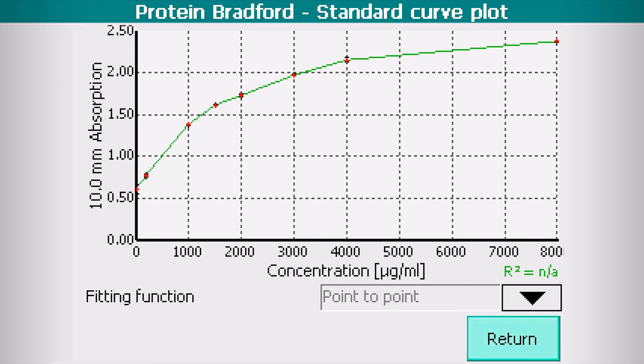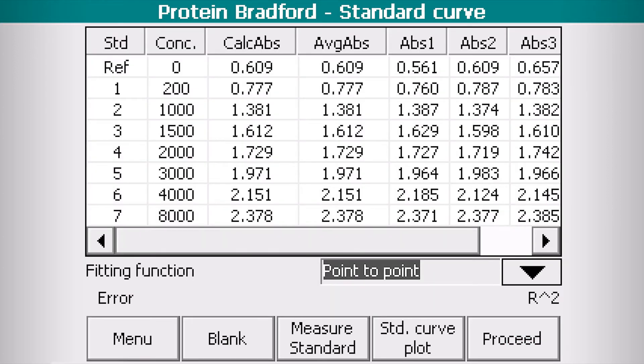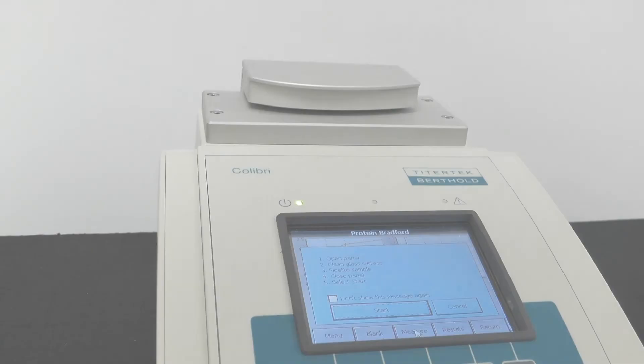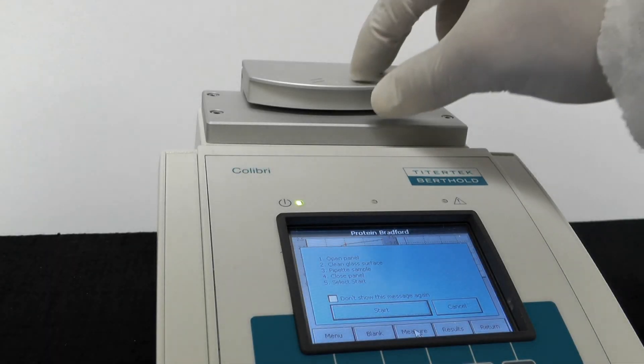When you are finished reviewing your standards, click Proceed. Now Colibri is ready for your protein samples. Click Measure and follow the on-screen instructions.